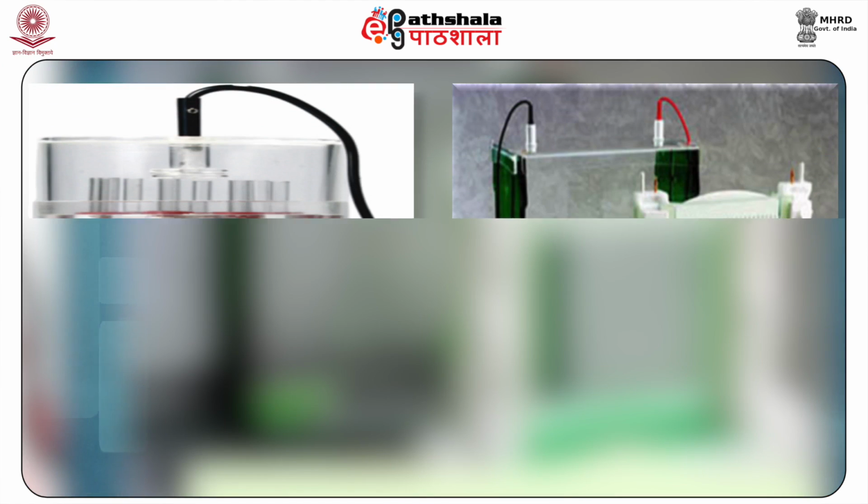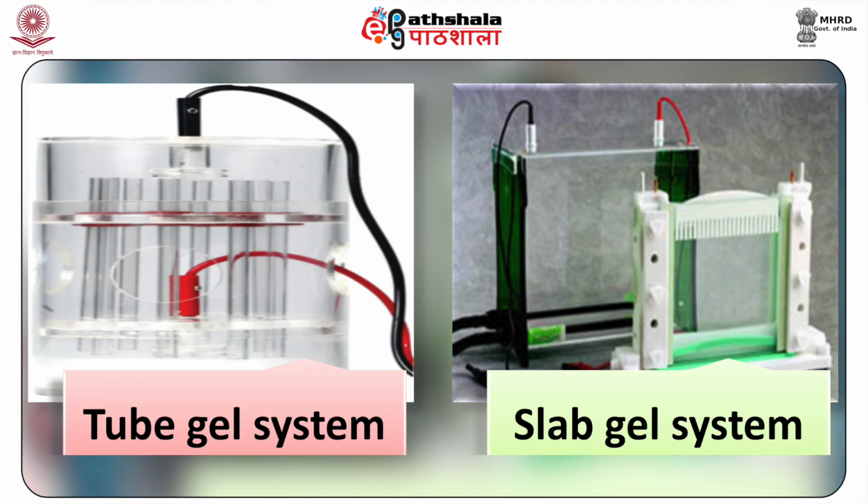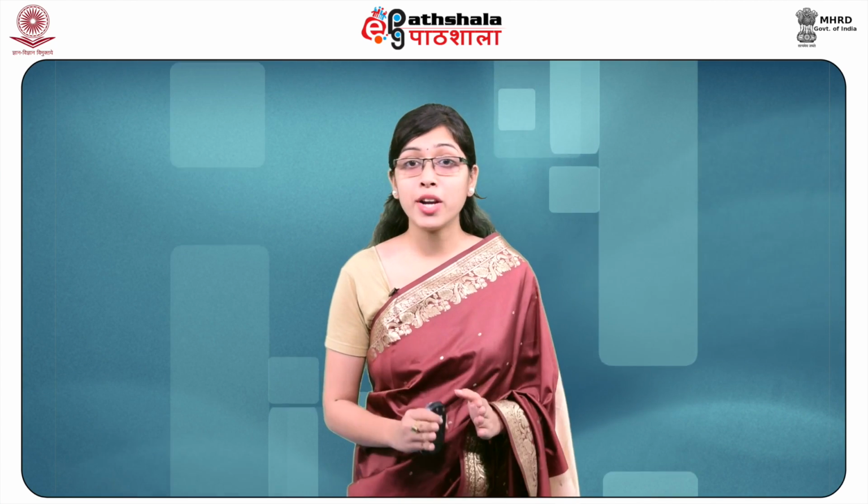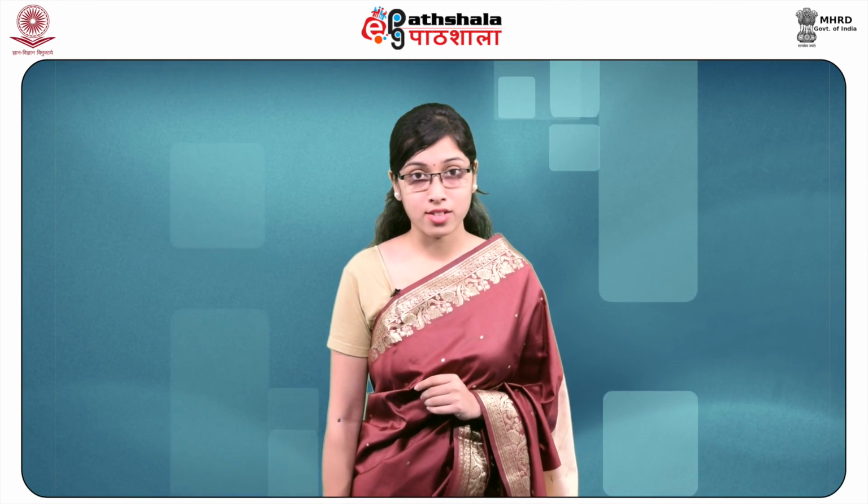Gel electrophoresis is based on two approaches. One, column electrophoresis, which uses tubular gels casted in glass tubes as shown in this figure, while the other uses slab gel as we have shown in this figure and uses flat gels formed between two glass plates.